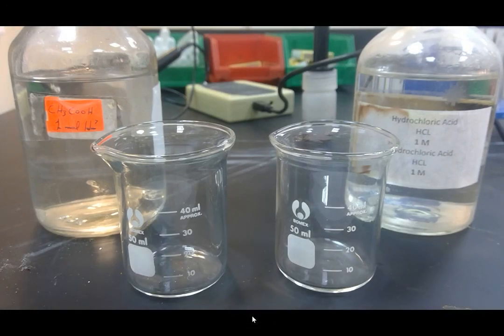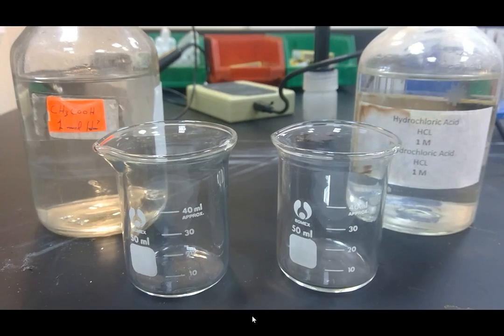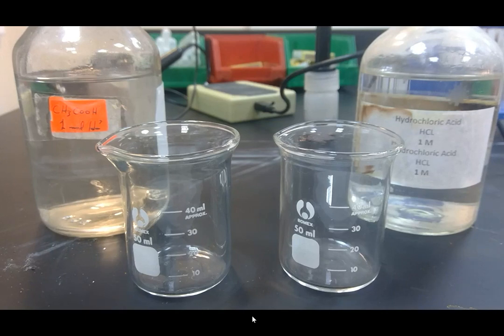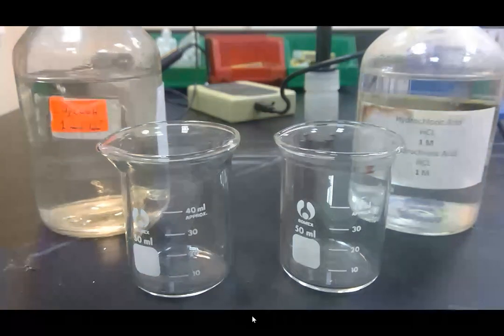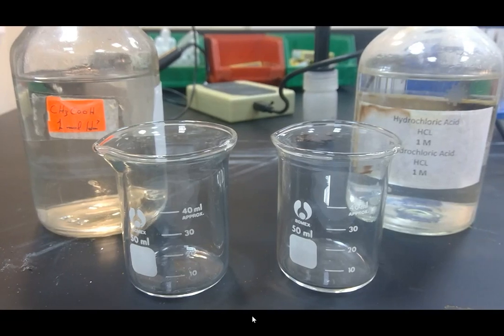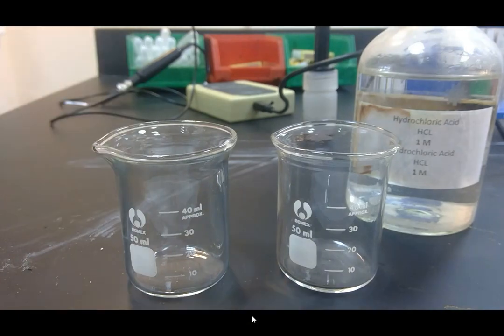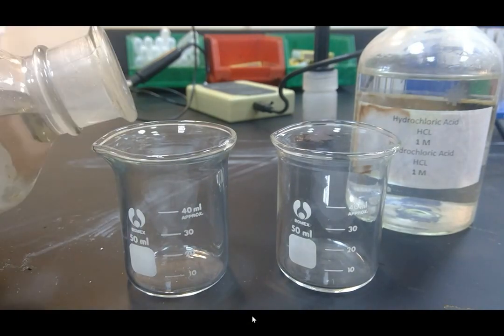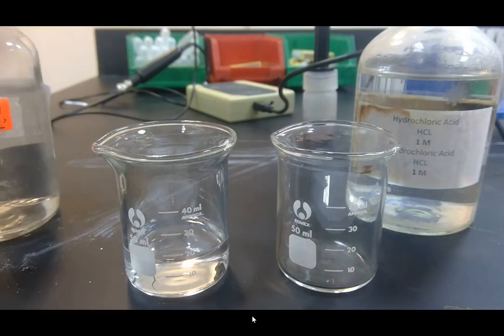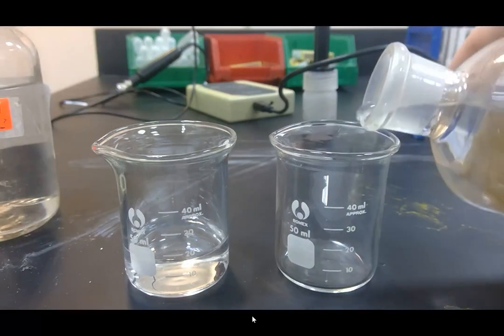We've seen that ethanoic acid is an example of a weak acid, and we are going to compare now the reactions of ethanoic acid, which is a typical carboxylic acid, with the reactions of a strong acid, hydrochloric acid. So to do this, first of all, I'm going to put approximately equal amounts of ethanoic acid into one beaker and hydrochloric acid into another beaker.